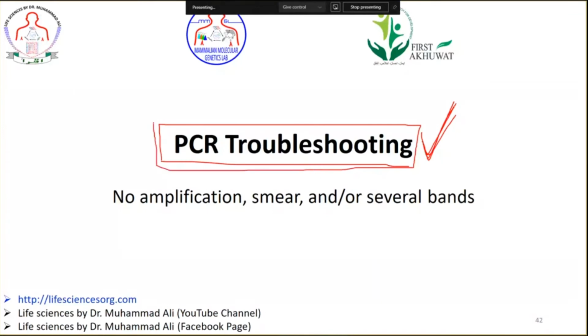Another question, please? Okay, this is from Rao Zubair Khalik. He is asking, shouldn't we design the primer manually in order to meet our requirements, that is melting temperature, primer size, and GC content?